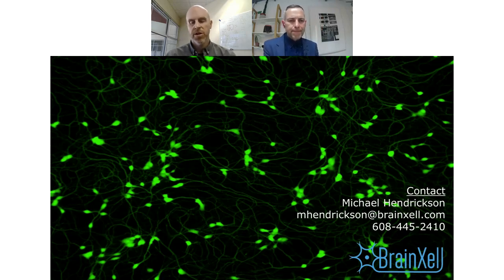Yeah, that's a very good question. I mean, I don't think there's an easy answer to that question, other than, you could do a measurement, I think, of the level of spontaneous differentiation within a line, and then you could triage lines. The challenge there is sometimes lines, if you subclone them, some of the subclones can be much better performing than the overall culture. And so we sometimes work with lines a long time to clean them up. And the reality of working with these lines is very different from what you might think if you just read published reports. But there isn't an easy marker to say, oh, that line will work, that line won't. Other than to say this overall quality is high or low.